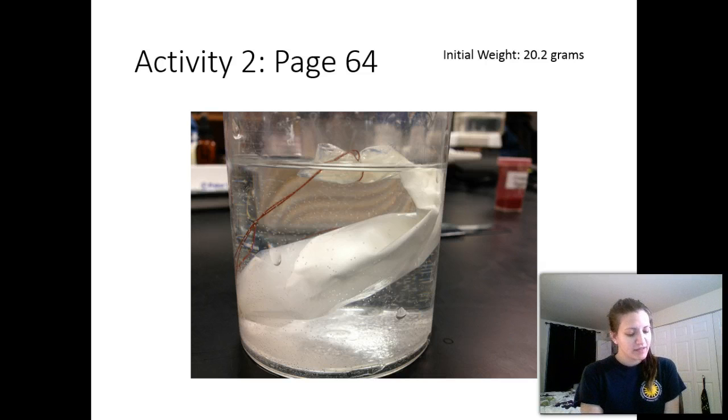The next question asks about the concentration of everything. The first one asks, is the highest concentration of salt inside or outside the bag? This would be inside. We put salt in the solution in the bag, but outside the bag we don't have anything. The highest concentration of sugar is also inside the bag. The highest concentration of starch is also inside the bag. However, the highest concentration of water is outside the bag.